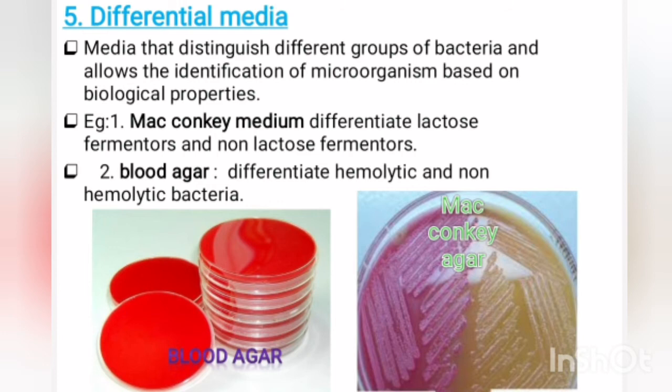Differential media. It is a media used to distinguish different types of bacteria, and it allows the identification of microorganisms based on the biological properties. An example for the differential media is MacConkey media.